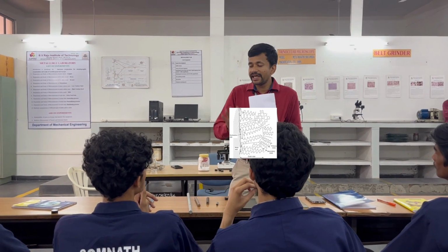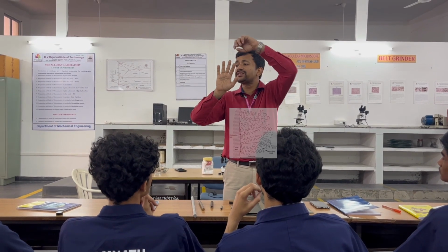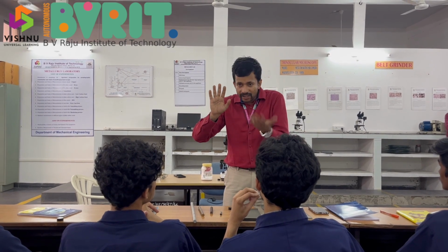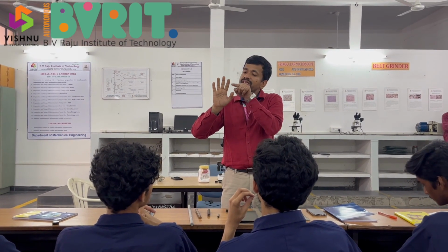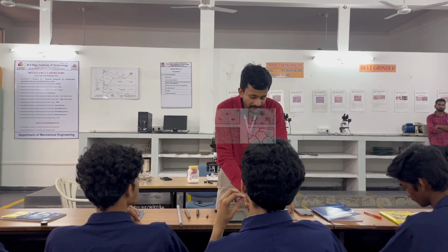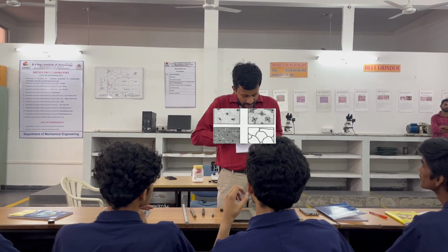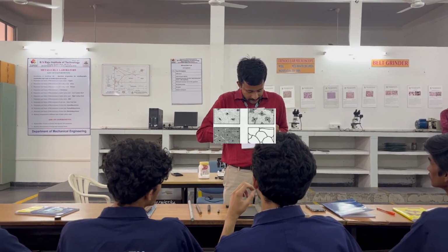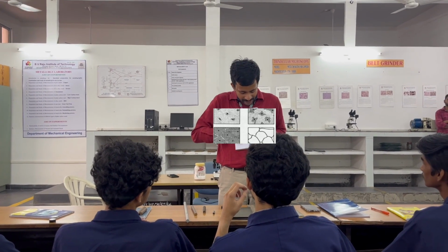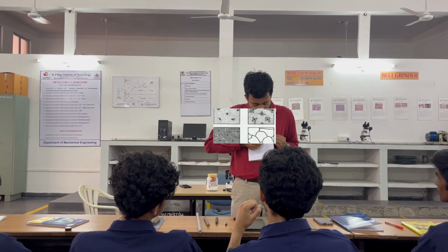And these dendrites are, like I said, a tree-like structure, something like this. That means there will be some branches, and in between the branches there is still liquid. And further cooling will do what? Even this liquid which is present in between these branches also cools down, isn't it? And then leaving behind something like this, isn't it? That means you still have some liquid which separates out.